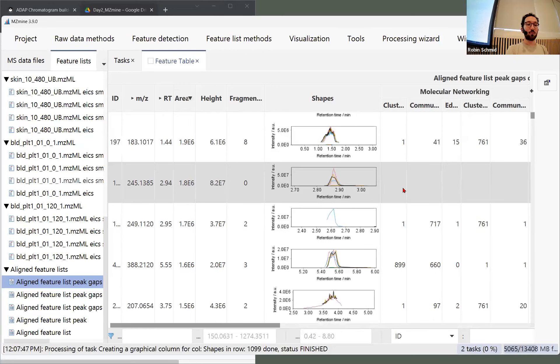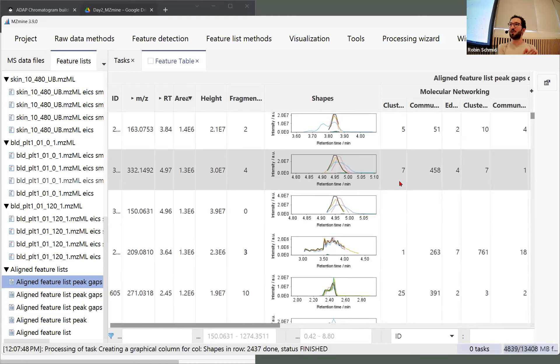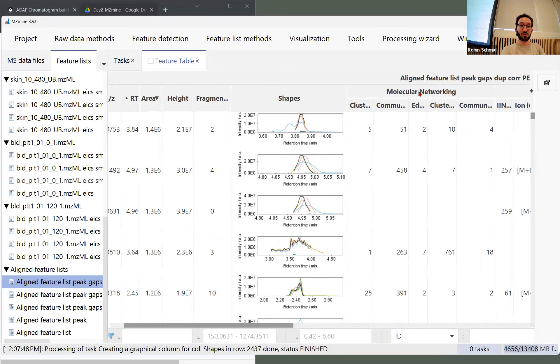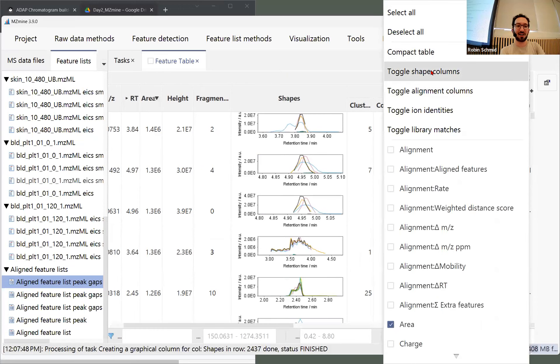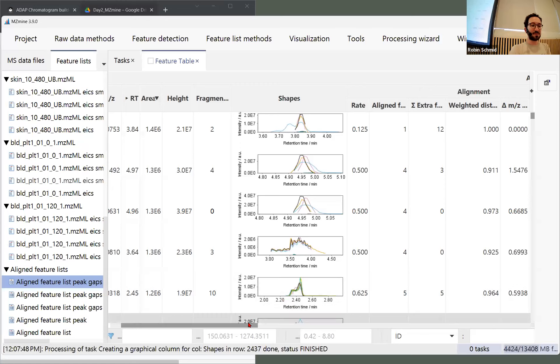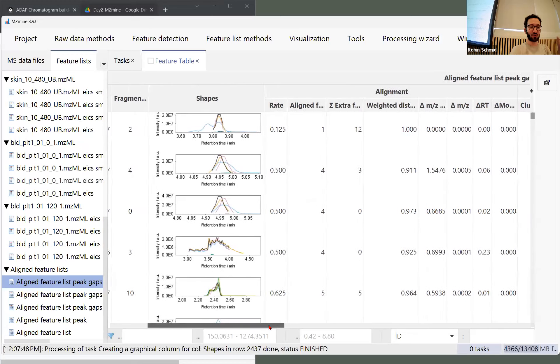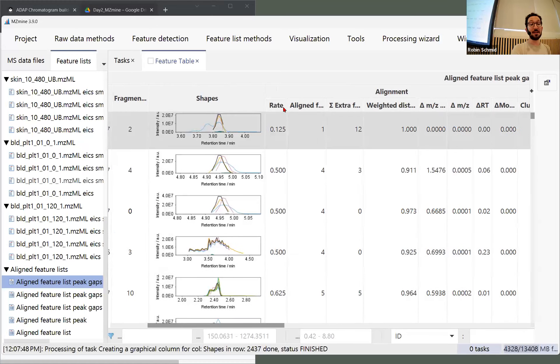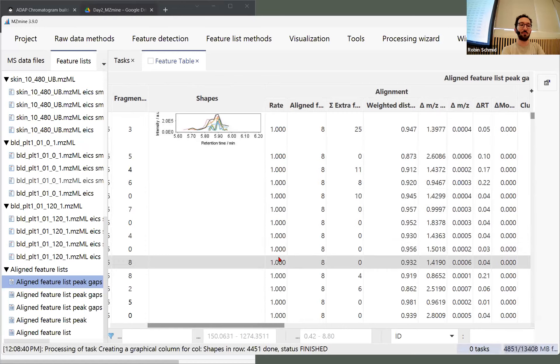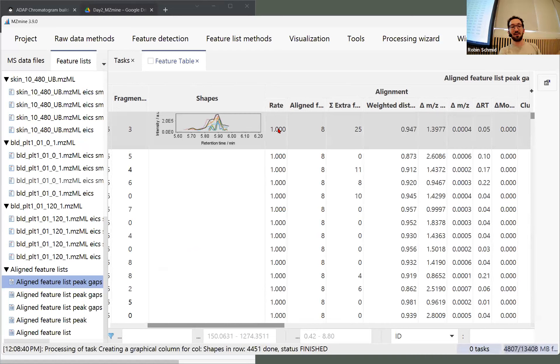It's very good to find those cases and note down the m/z and retention time so you can check the resolving and alignment steps. We set the alignment very wide — 0.4 — that's a lot, especially for a nine-minute RPLC gradient with very narrow peaks. To see the alignment columns, go to the plus button — there's a toggle alignment columns button — which will bring up or remove the alignment columns. Make sure you have them to follow along.